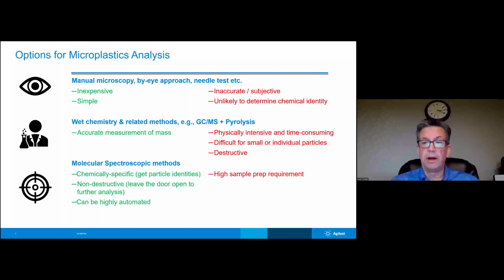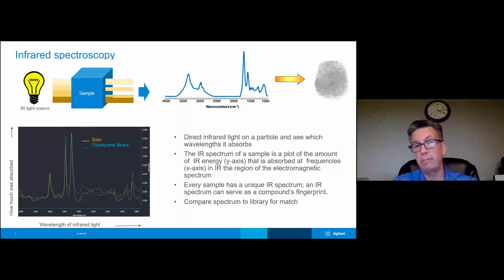Now, what is it about infrared? Infrared is a vibrational spectroscopy technique. Essentially, the samples are exposed to a source of infrared radiation, and at the characteristic vibrational frequencies of a particular sample, they will absorb that radiation, producing a peak. A molecule might contain different atomic combinations, and each atomic combination will have its own characteristic vibrational frequency. The set of frequencies then gives us an infrared spectrum.